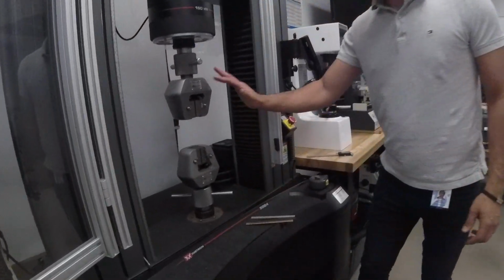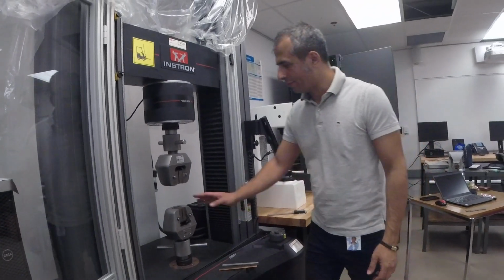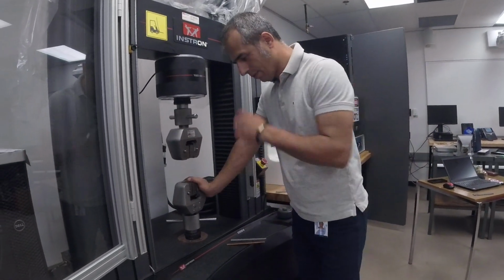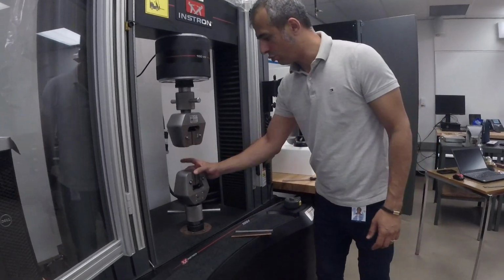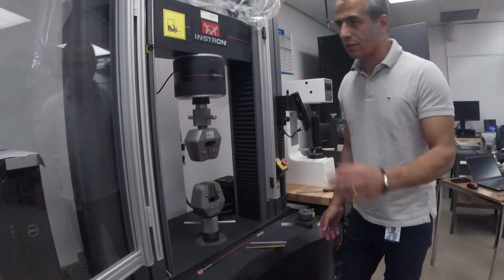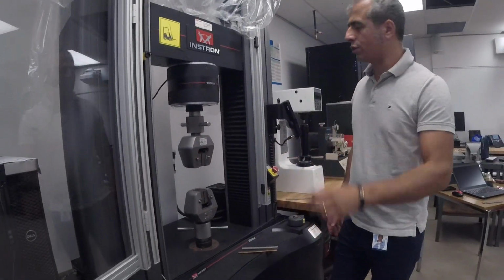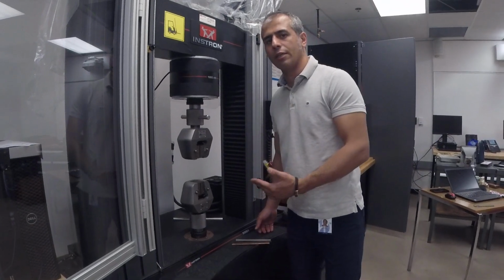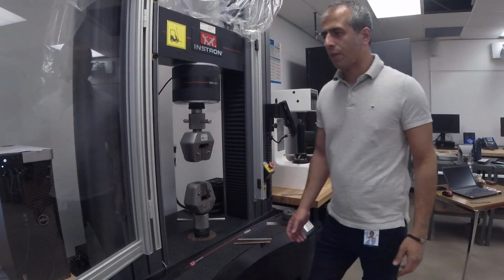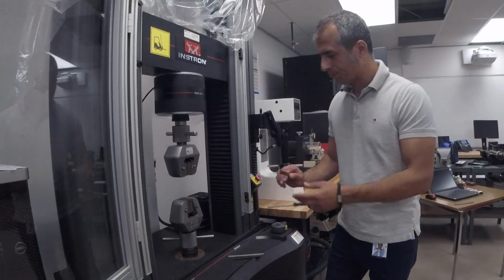Back into our instrument machine, just again a brief explanation about the machine. We have two jaws here, fixed jaw and movable one. We are going to fix our sample here between those two jigs, and then software automatically applies the force, and we could see the stress-strain graph and the whole process from elastic to plastic, and then past the maximum, necking and breaking. So I'm going to start with copper sample.